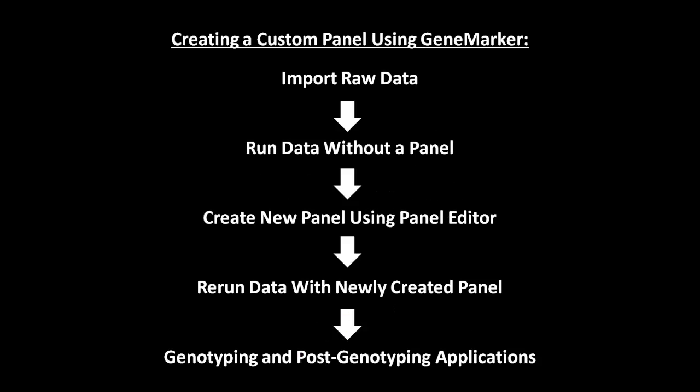Genotyping panels for most common kits and chemistries are easily obtained. In fact, many of them are installed with GeneMarker. However, no such panels exist for custom chemistries and specialized probe mixes, requiring the user to create their own. The panel editor in GeneMarker facilitates this process.